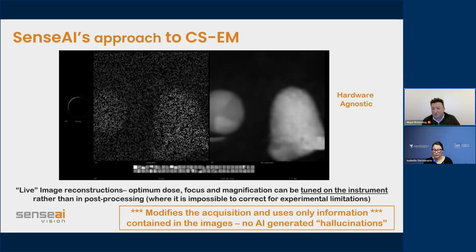So for an EELS map or an EDS map or a 4D STEM map, you can go back to this more randomized approach to going through the system. And that helps you to distribute the dose, which means it reduces the effect of the damage on the sample, and it allows you to get that information in a very accurate way. So it really is dependent upon the experiment you're trying to perform, the damage that occurs in the sample, the stability of the microscope, and the speed that you're trying to acquire the image.